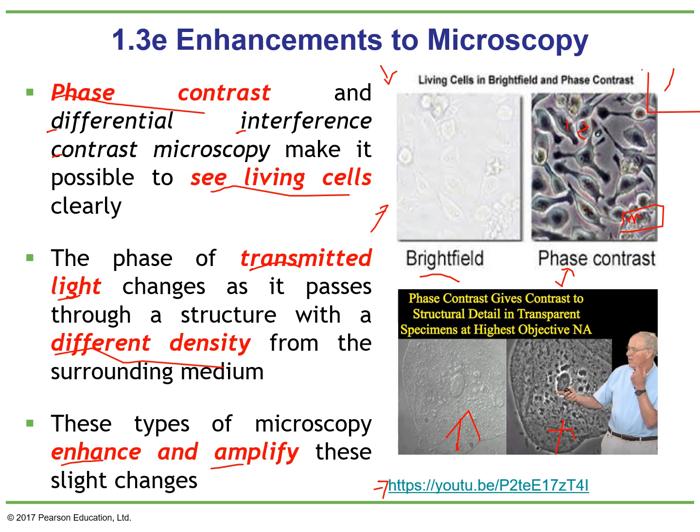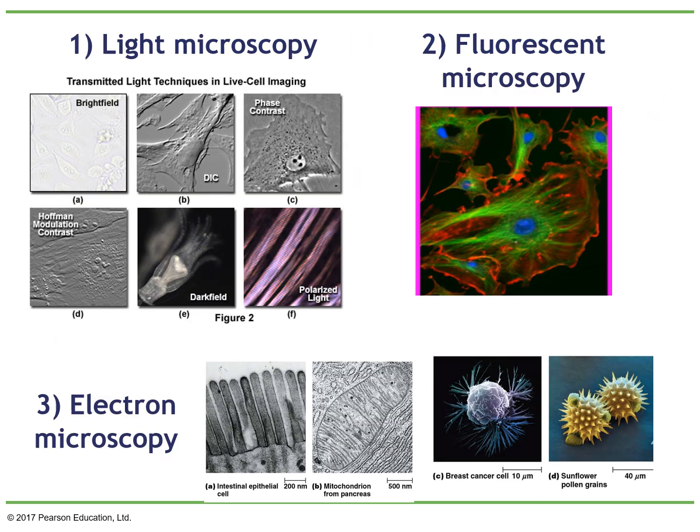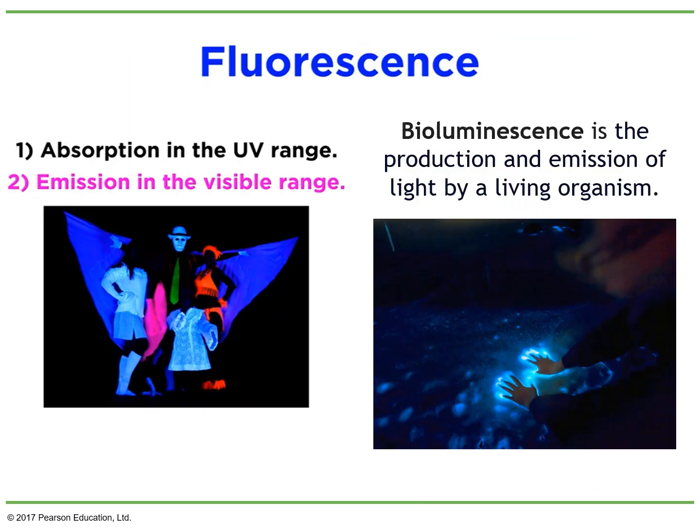Now I'm going to move into another tool, fluorescent microscopy, that we are also going to see in the lab. So we finished this section about light microscopy, and now we're going to move into fluorescent microscopy. To start, we're going to ask the question about fluorescence. What do you think fluorescent is? In the following slides, I'm going to talk about fluorescence.